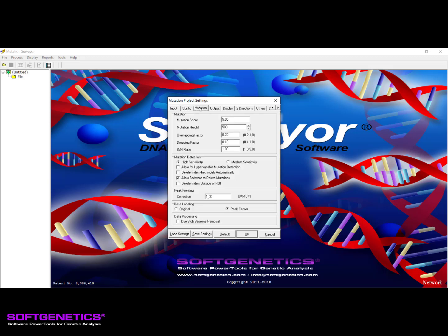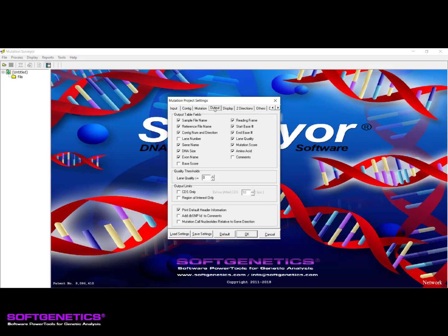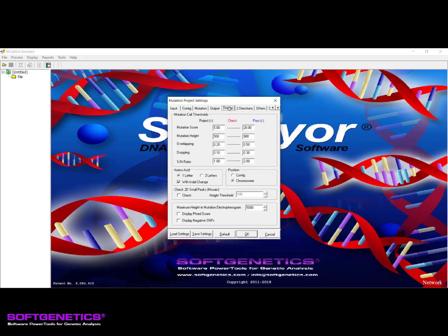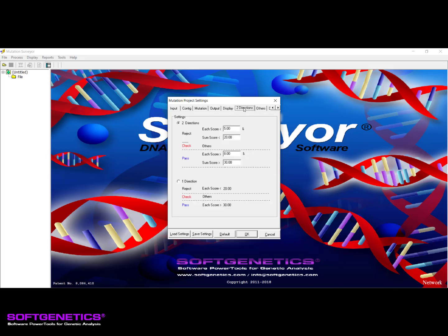The Mutation tab includes all of the settings that will affect mutation detection. The selections for what is to be displayed in the standard reports can be found on the Output tab. The Display tab is the location for the settings that pertain to how the mutation calls appear and also some of the preferences for the graphical analysis display, including the 2D small peaks for low frequency detection. The Two Directions tab allows for adjustment of mutation call thresholds when working with bidirectional or single directional data.